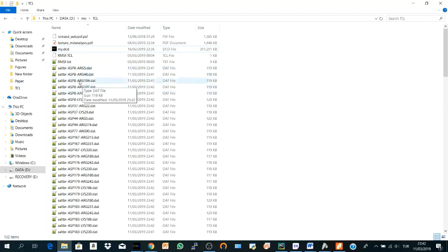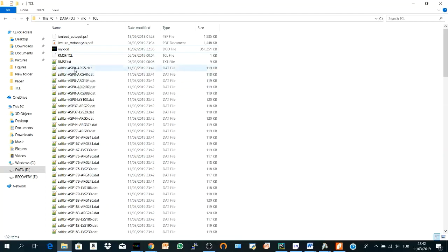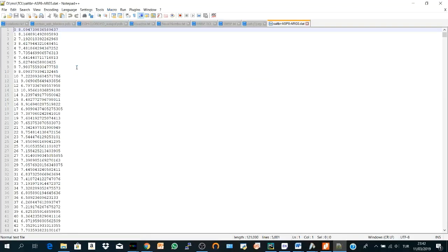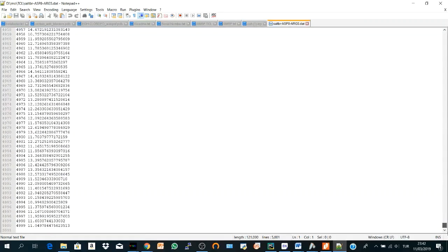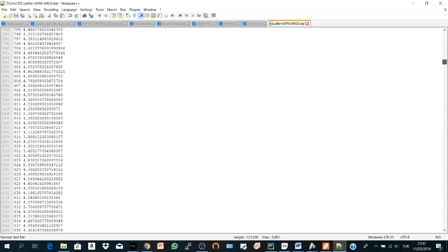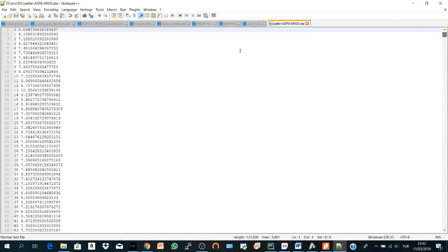Here we have a salt bridge between these two residues. If we open it, you will find it from the first frame. Let's go down to the last frame and here is the distance.